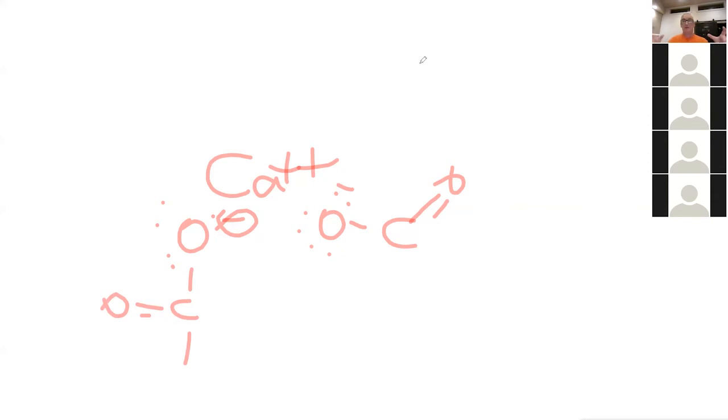Then you start pulling these head groups together in shapes that they weren't in before. Basically, you're forcing them into being associated with calcium, and you're forcing it into a specific shape. Whereas before, they were sort of just free to move around.